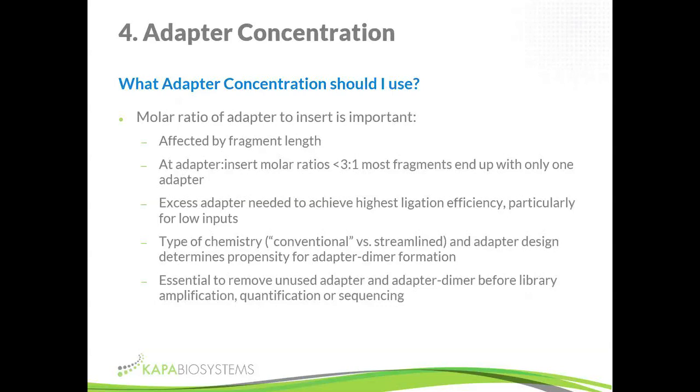And so you need to use an excess of adapter to achieve the highest ligation efficiency. The lower your input, the more adapter you use, you can push the efficiency of the ligation reaction by using more and more adapter. There are limits to it, though, and it depends on the chemistry. Because you're using an excess of adapter, the adapter itself can ligate to itself, even though it has a T overhang that's not compatible with the T overhang of another adapter. It is possible to ligate adapters together.